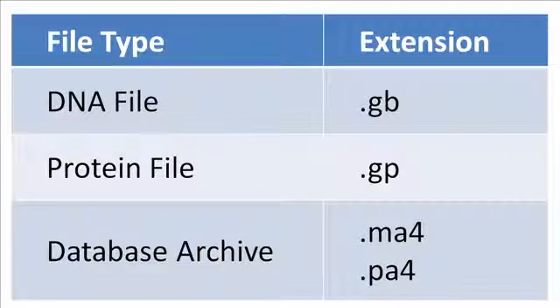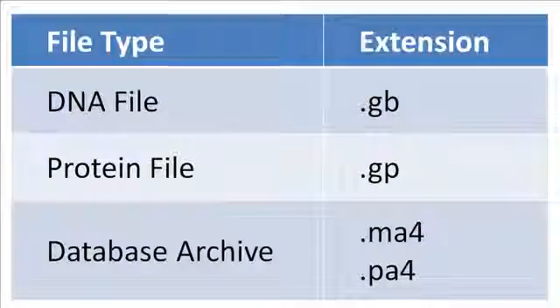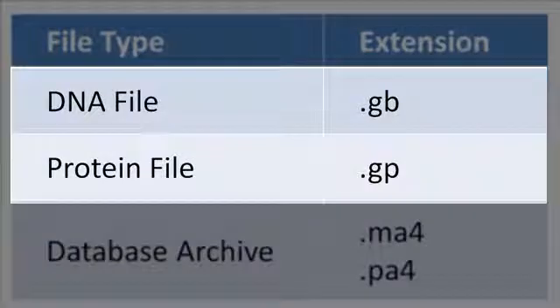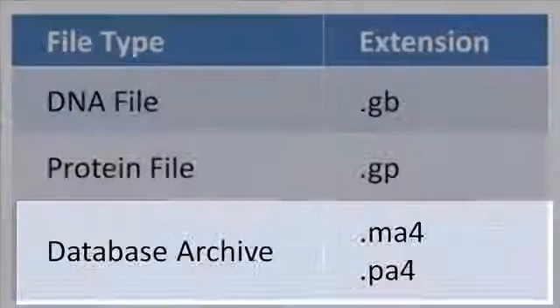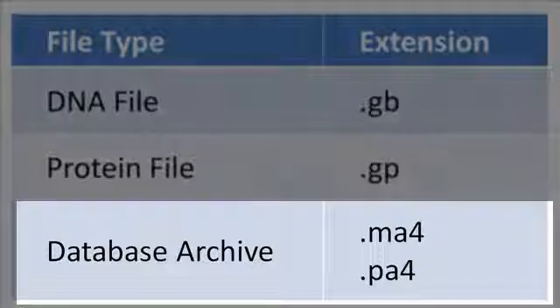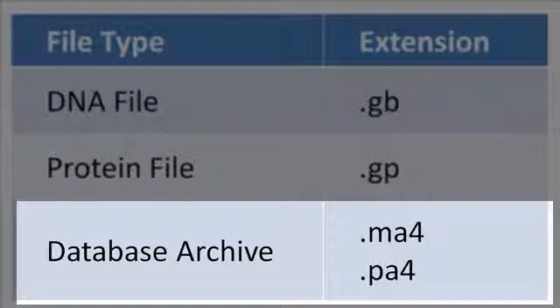SeqBuilder offers a one-step batch import of Vector NTI data and protein files, as well as Vector NTI database archives.